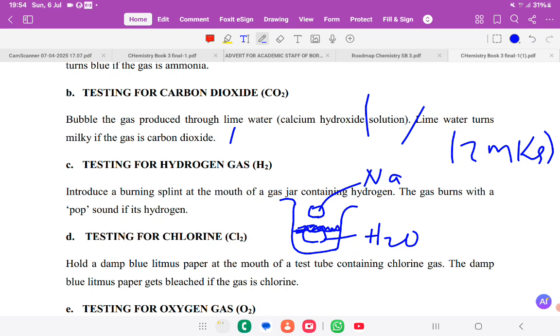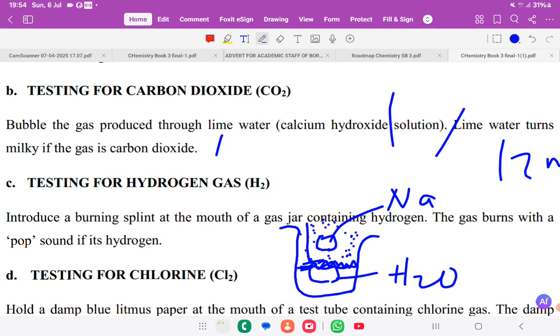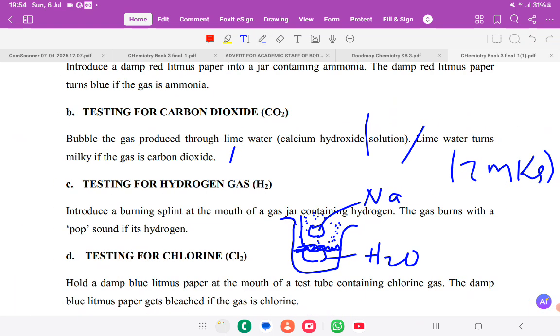If you watch this, there's going to be some gas in the form of cloudy fumes, in most cases whitish or grayish in appearance, which is basically hydrogen being produced. You would actually see something like smoke being produced. This is going to be hydrogen.